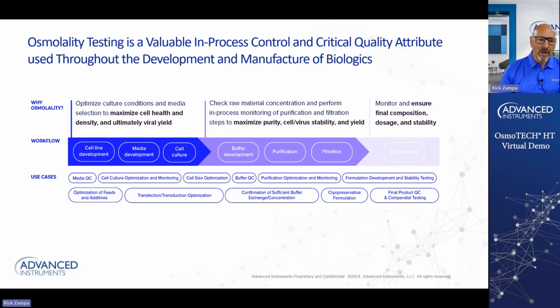For injectable drug products, the osmolality of the solution must be in the physiological range, or it must be close to the osmolality of blood, since a higher or lower osmolality can cause pain at the injection site by creating a hypertonic or hypotonic environment.